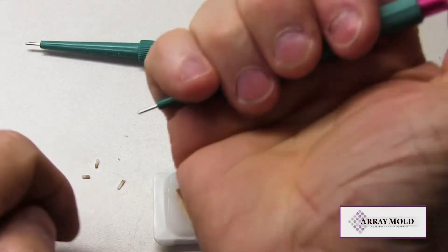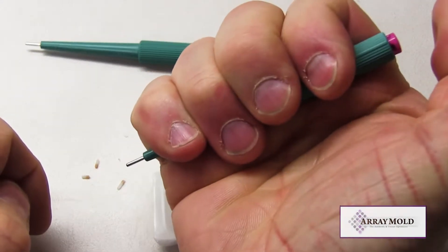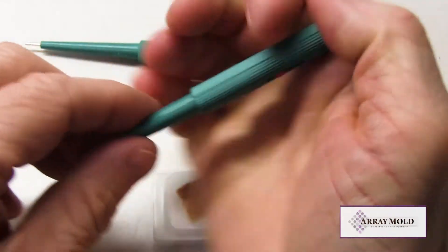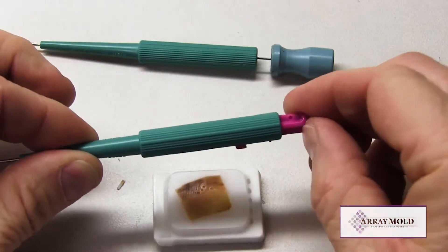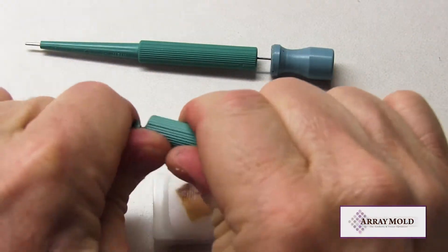The plunger needle, on the other hand, with the internal plastic plunger rod, will collapse after several punches because it was not originally designed to work with formalin-fixed paraffin embedded tissue samples for TMA construction.